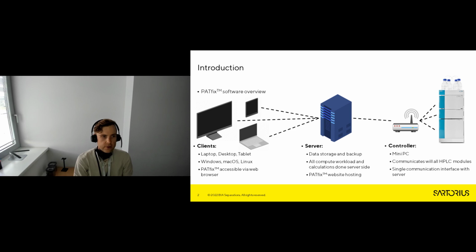So this is just a brief overview of the architecture of the PATfix software. Hopefully you will be able to understand how this works as a complete unit.